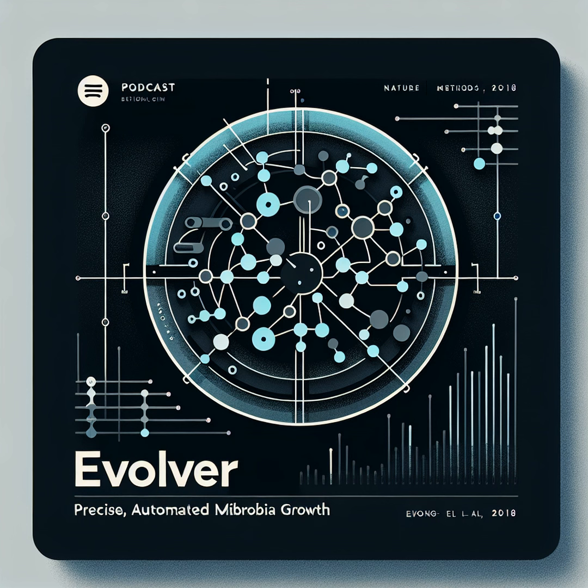Precisely. And it's not just about temperature. The paper also showcases eVOLVER's versatility in tasks like dynamic media mixing, preventing biofilm formation through automated transfers, and even automated yeast mating. All of these highlight the remarkable flexibility of its modular platform. This really underscores the versatility of the system. It moves beyond simply speeding up experiments to allowing for entirely novel experimental designs.